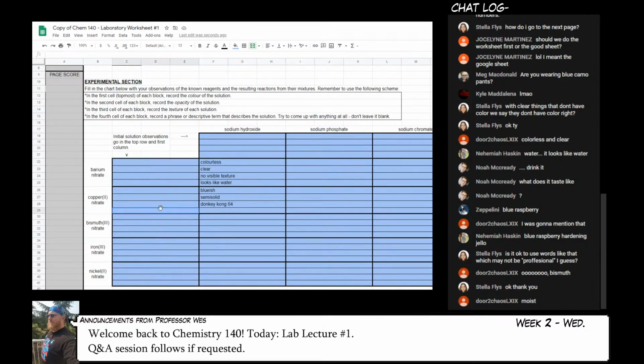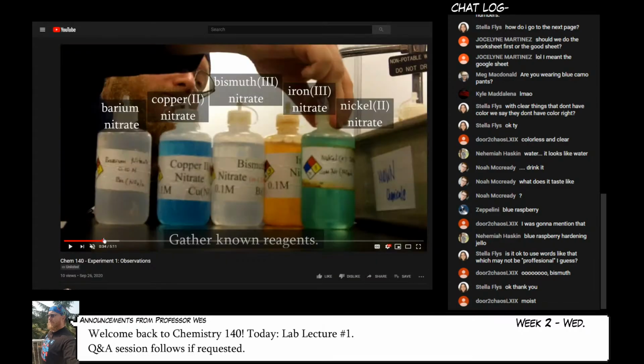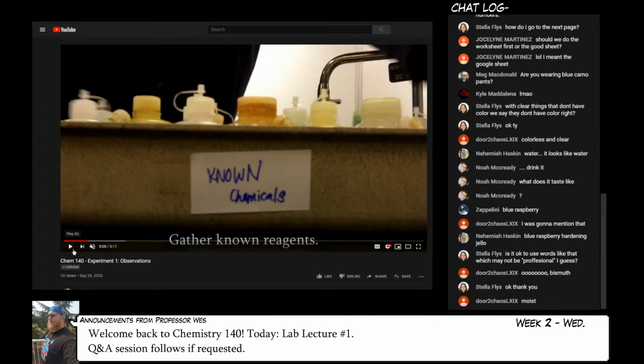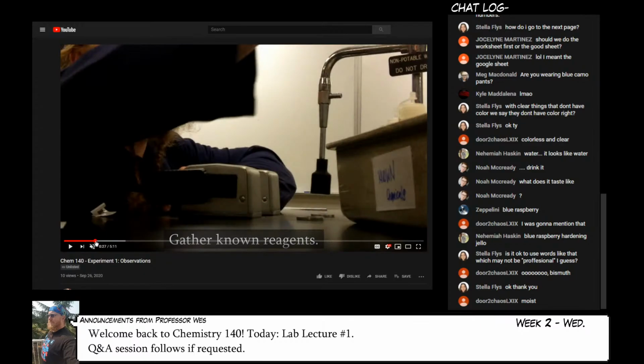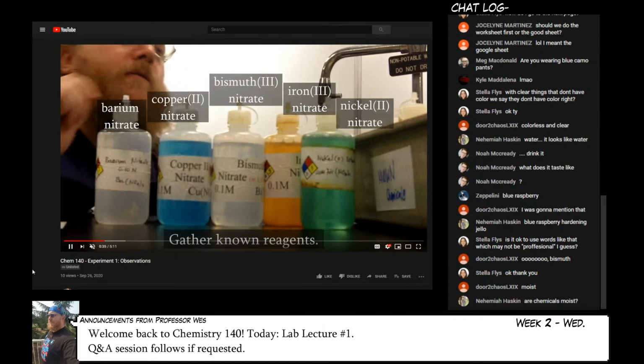All right. So again, these boxes on the side are for the solutions by themselves. I show you the solutions at the start of the reaction by themselves. So here they are being added. I'm really fast when I put solutions down, so you're going to have to do this quickly. No, I'm just kidding. You can pause the reaction at any time. In fact, I even tell you to pause the reaction: you can hit the space bar or hit pause on the video. These are all aqueous chemicals, if that's what you're asking.